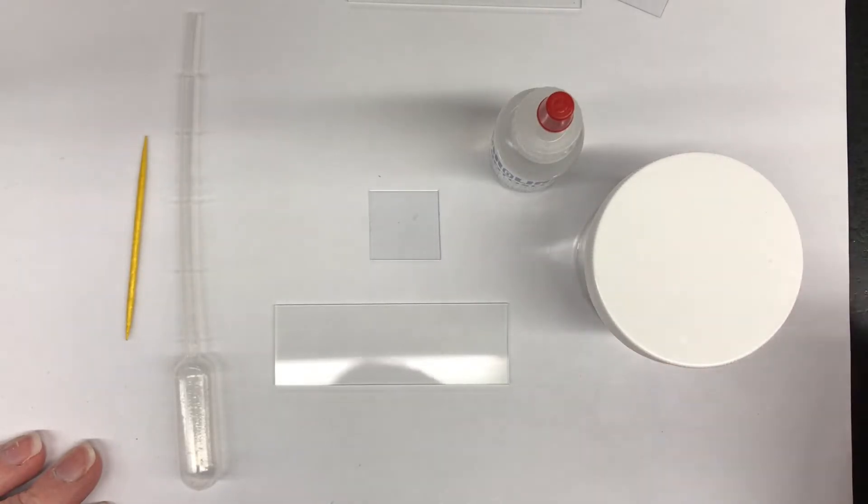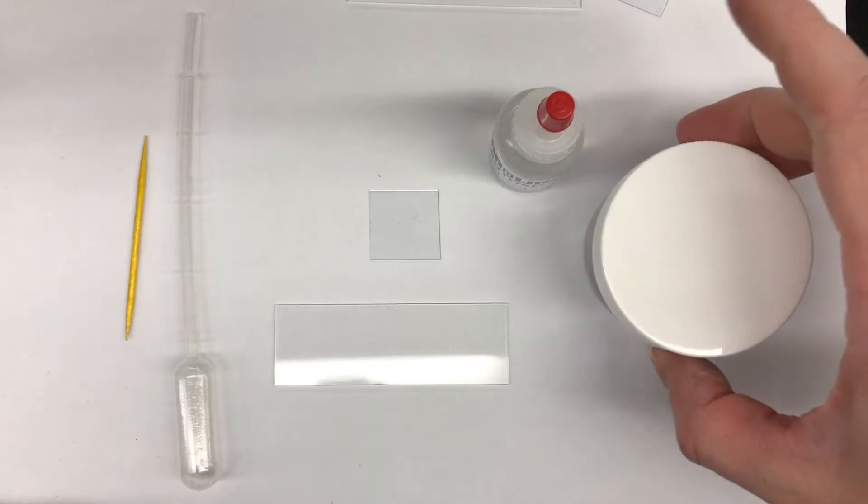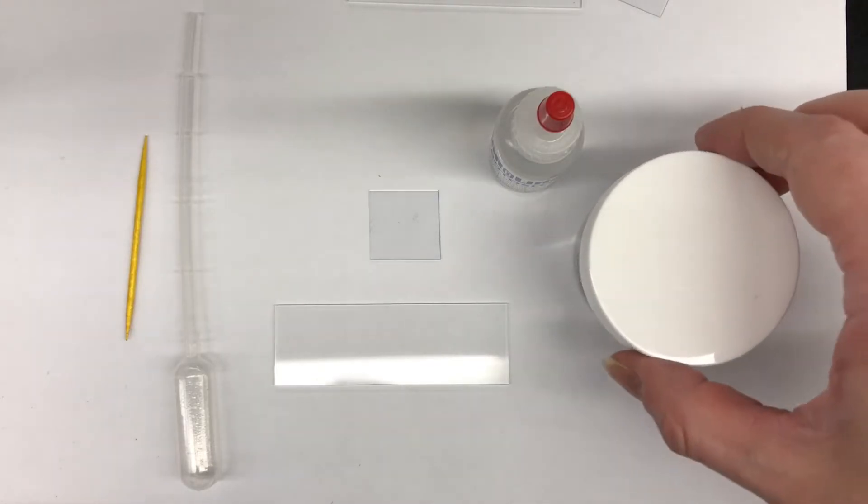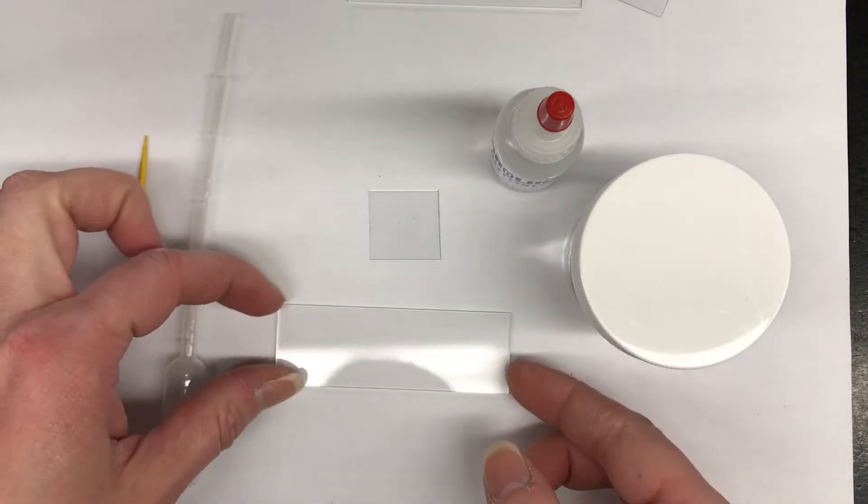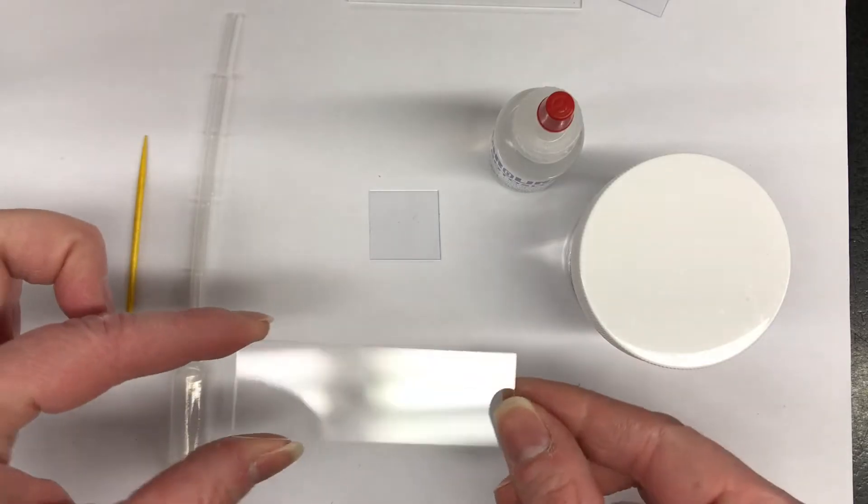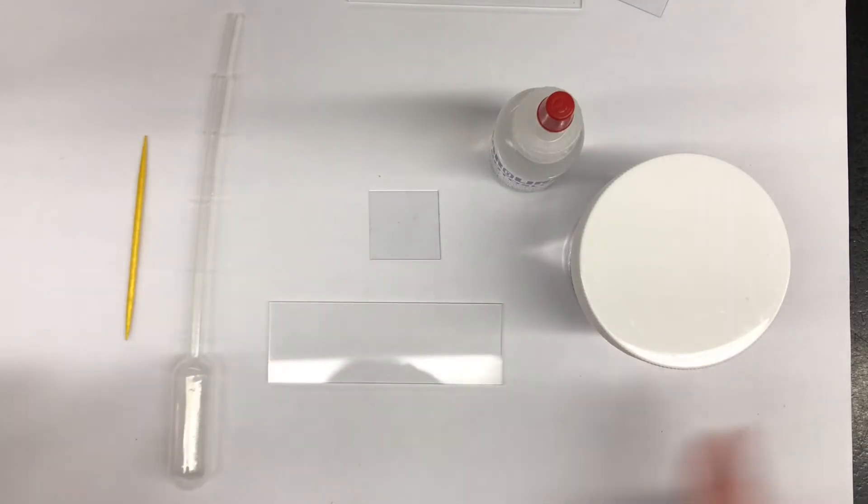The first wet mount slide I'm going to make is with the amoeba. So first, you make sure that your slide and your cover slip are clean. These are both nice and clean.